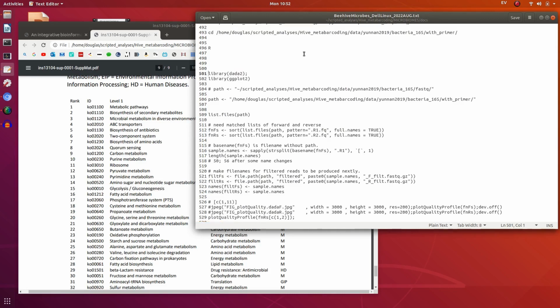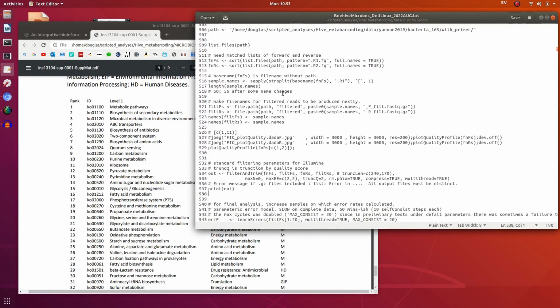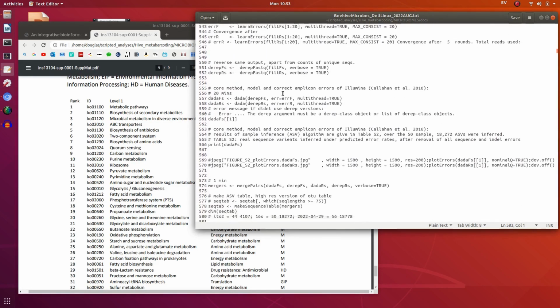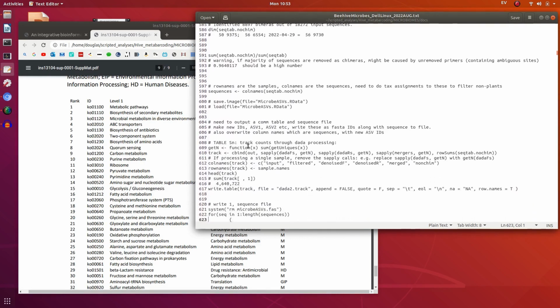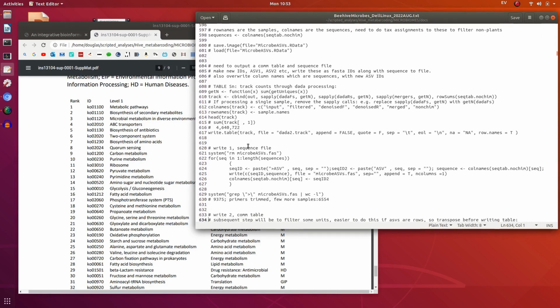So this is our library for processing metabarcodes or metagenomes. All these commands are standard. You'll find them if you go to the manual and tutorials. You'll find all these lists of commands. So this creates ASVs, which are high resolution entities from 16S metabarcodes.